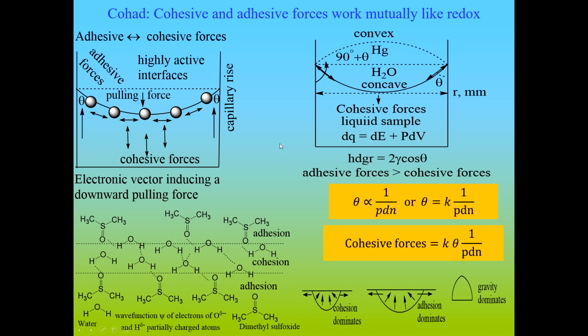And we have seen the pendant drop, when the solution, solvent or nanoemulsion is permitted to flow through the capillary. There are two models of the flow, the continuum model and the non-continuum model. In the continuum model, the flow is continuously connected to the reservoir sample, but when it is cut in between, it will develop a pendant drop. So we have seen that theta is inversely proportional to the number of drops developed by the prescribed volume of the sample. These are measured with a survismeter.